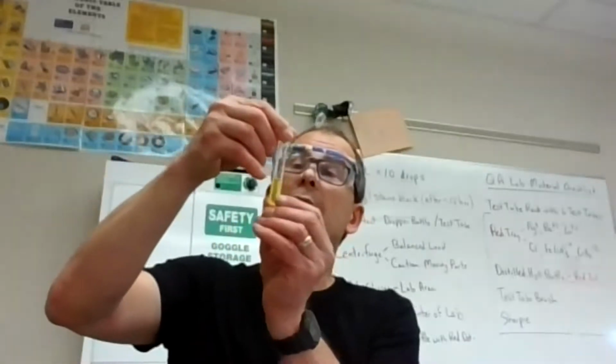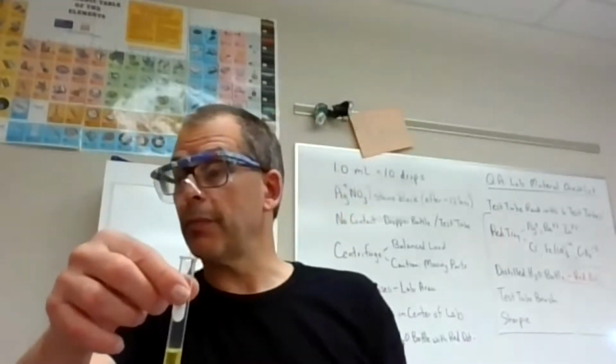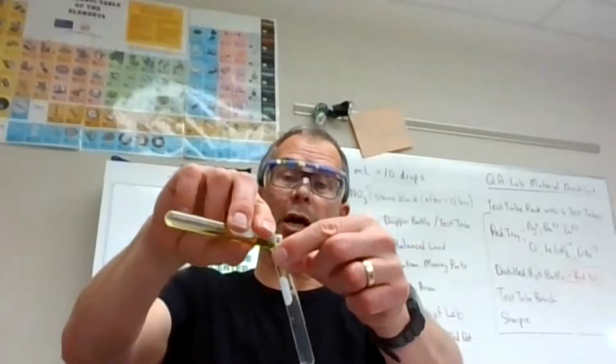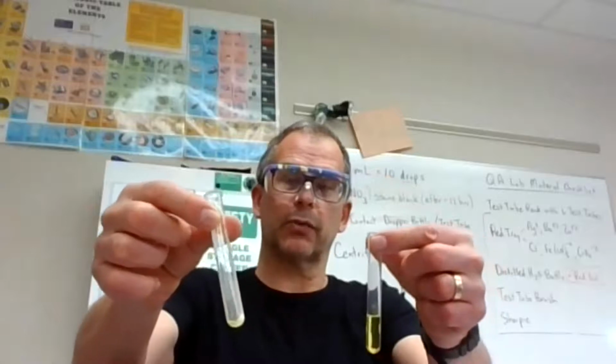Slow it down. We'll see what we have in our centrifuge. And yeah, it's still a little frosty on the sides of the glass, and you can see kind of a pretty significant chunk on the bottom. Okay, not as strong a reaction as some others, but definitely that's all you need to see precipitate formation here. And then the last step, we're going to skim off the liquid. Again, looking pretty clear. You can see the frosty glass, the stuff on the bottom. And I'm going to add CO3 to this next step.